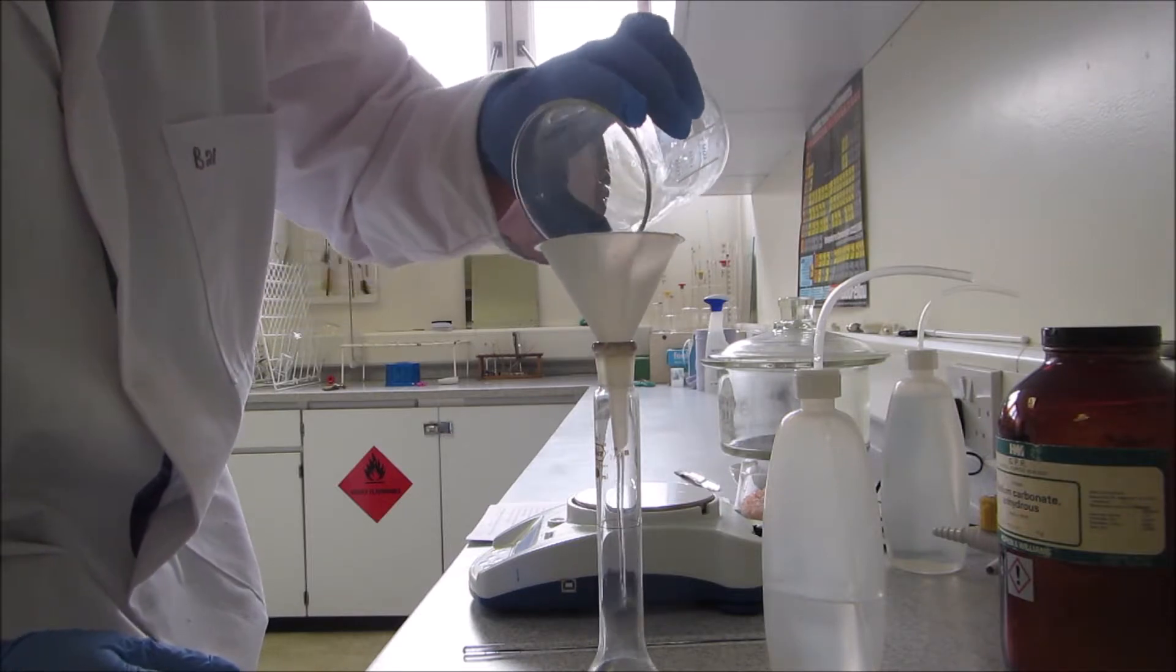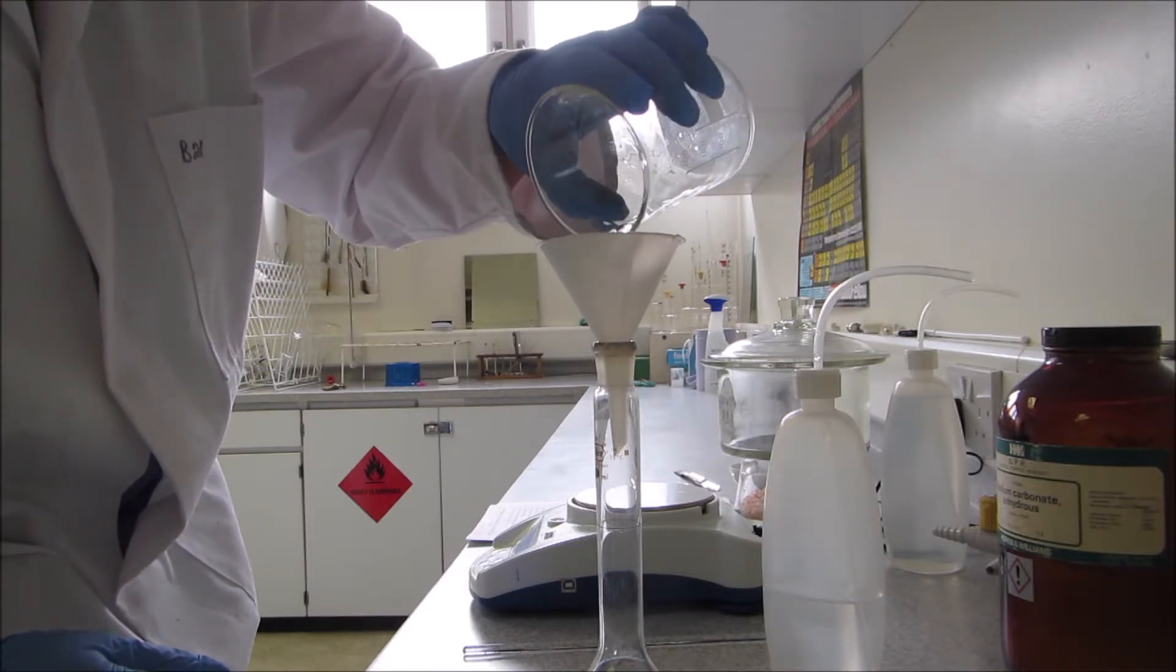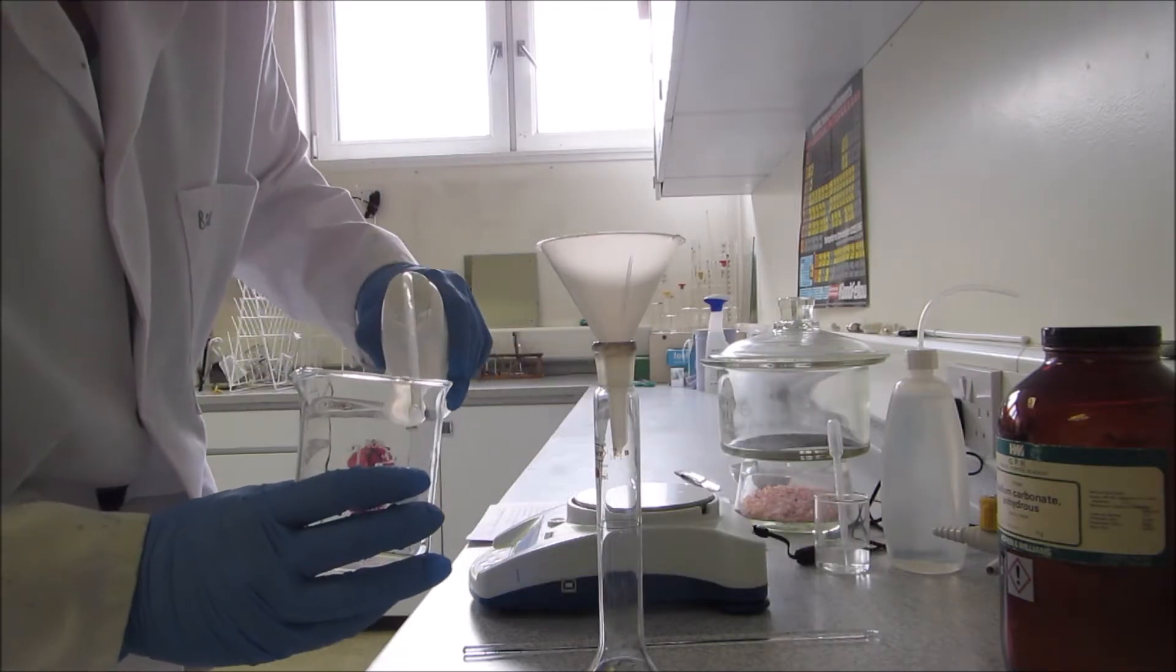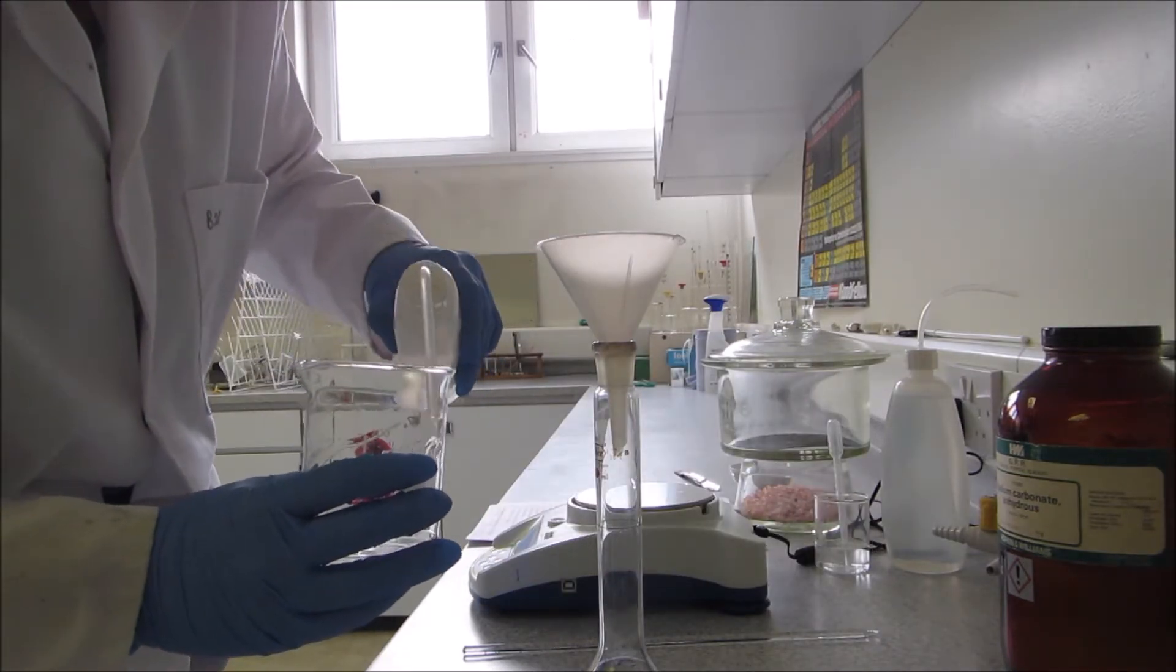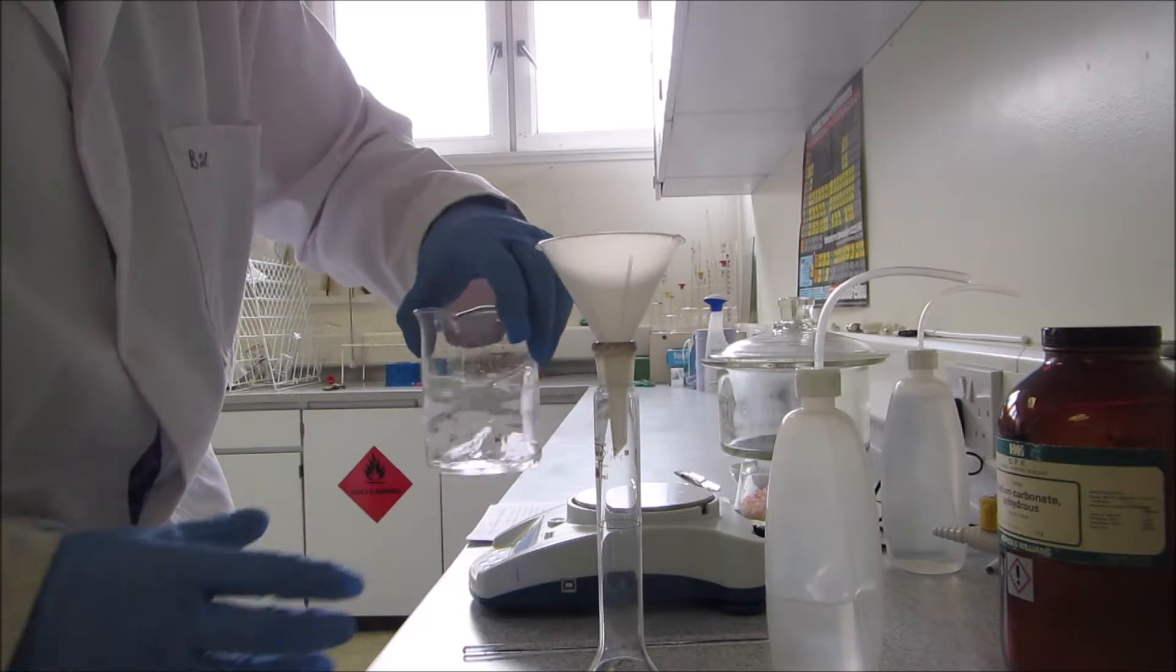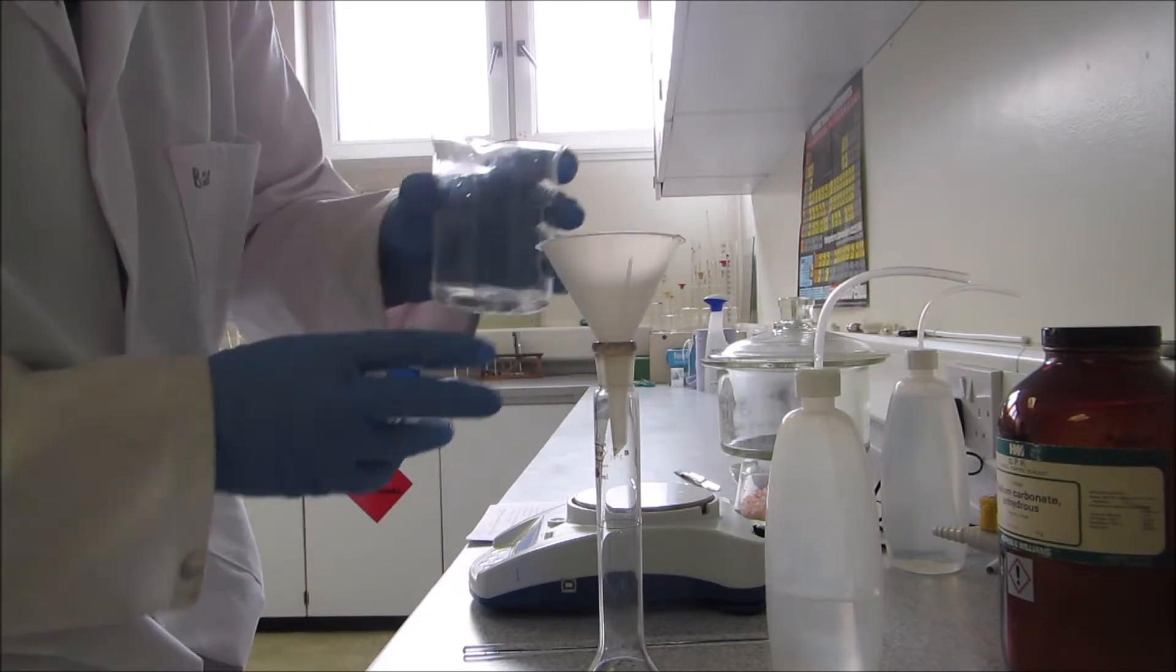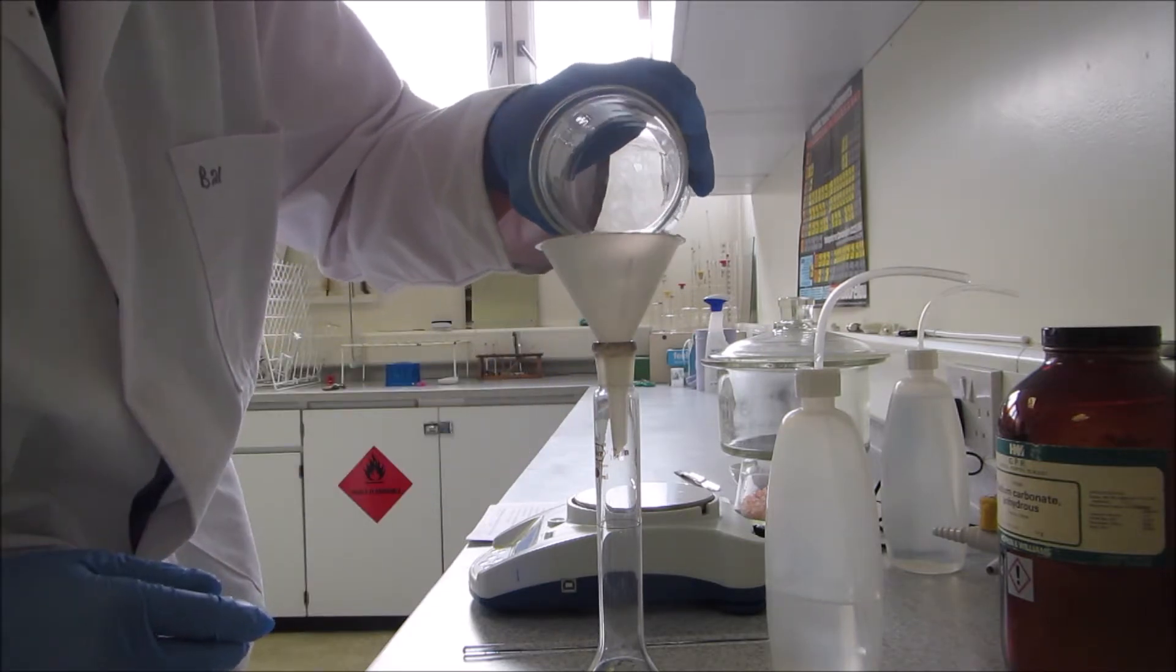Now again, there could be some of the sodium carbonate solution in my beaker, so I'm just going to add just a tiny bit of water and go around the edge of the beaker. Give it a swirl with my hand and pour that into my volumetric flask.